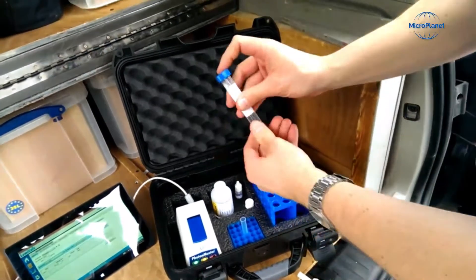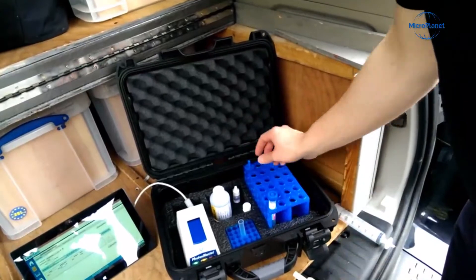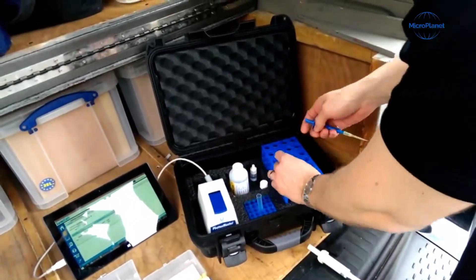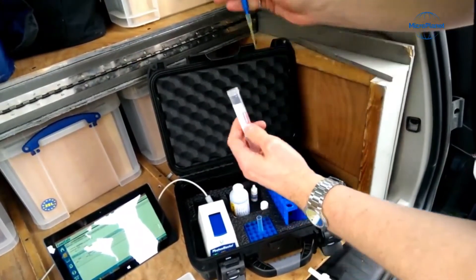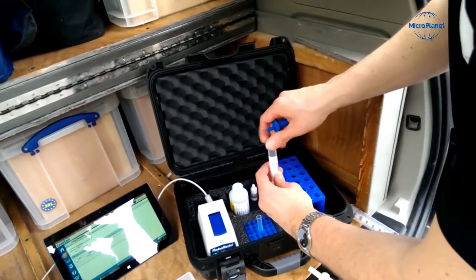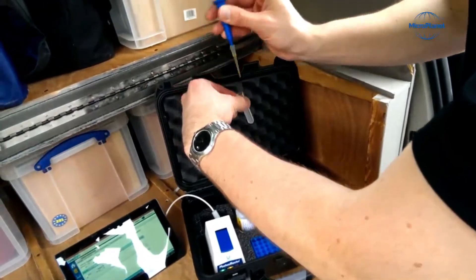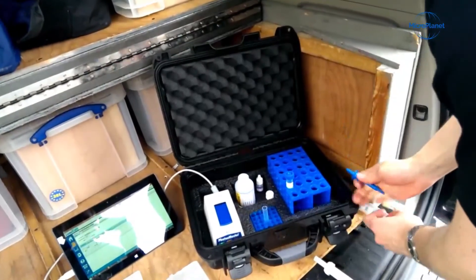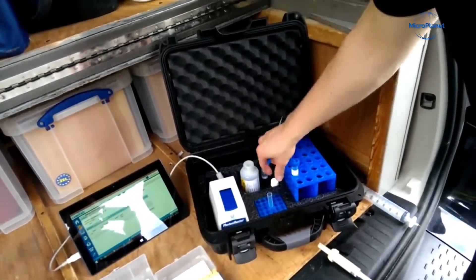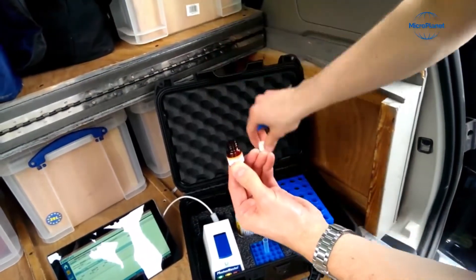The diluted extract is capped and mixed. And then from that we draw 100 microliters and add it to a new cuvette. The final step is to add 100 microliters of Luminase to the diluted extract to complete the assay.